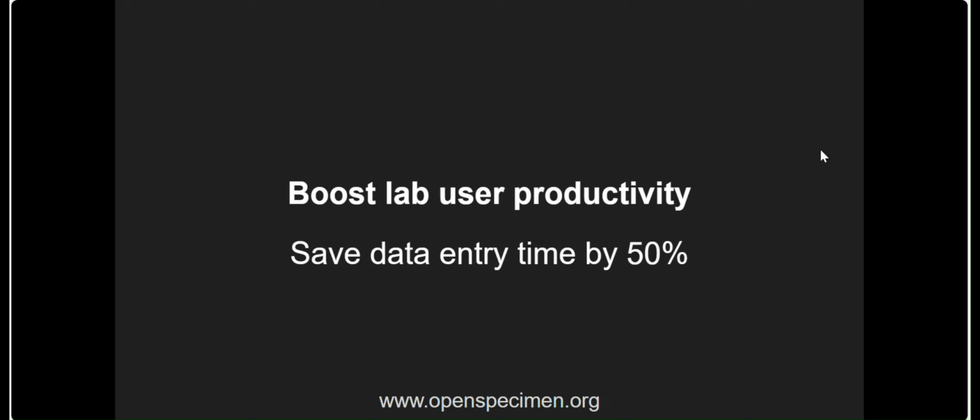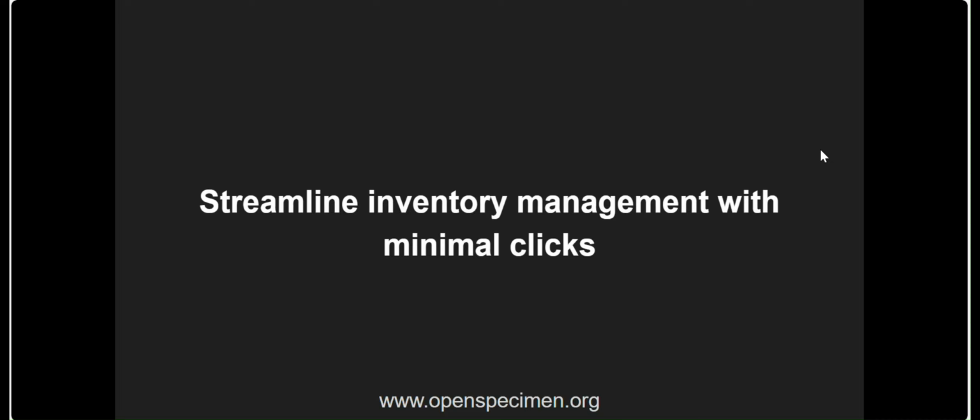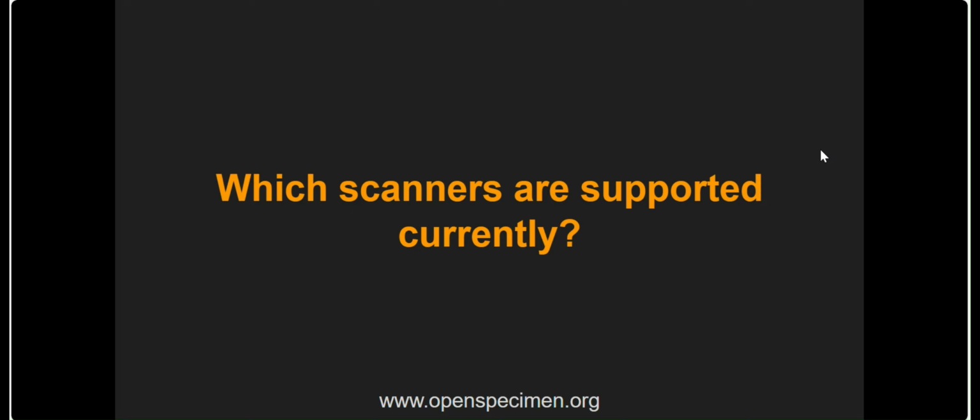It saves data entry time by around 50%. It also eliminates the data entry errors. It is known to streamline the inventory management with minimal clicks. This is a huge saving in terms of time and efforts.